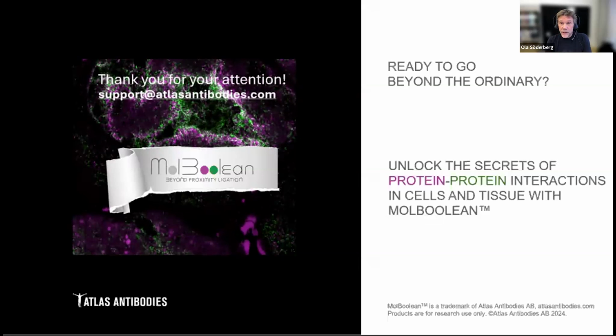There are also situations when you have a conformational change when you activate a protein. I think a long time ago we looked at the EGF receptor, and when the EGF receptor binds EGF, you have a conformational change, and there were some antibodies that no longer bound when you stimulated it. So it's always: are the epitopes available? I think it's always a crucial question, and the only way to address it is to try. Does it work or not?